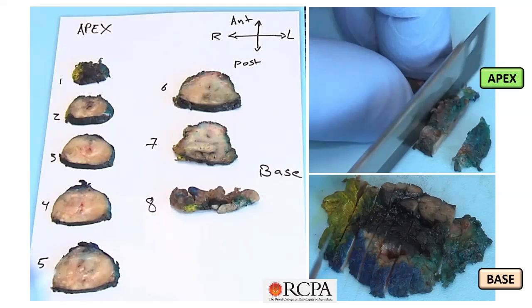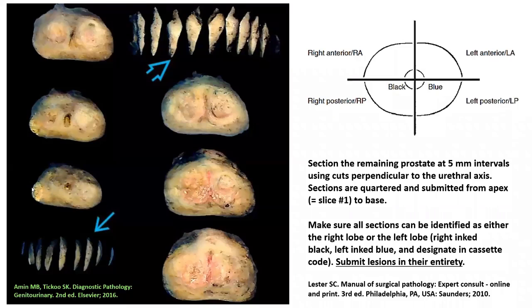Now, ideally, you should section out all these levels as quadrants, or if the section is pretty large, you might even have to give 6 sections. You might have to sextant it out. However, that will lead to probably around 45 or 50 or more blocks for the entire specimen, and the cost factor might not justify such grossing. In that case, you will have to search out areas which are suspicious looking, like over here you see the suspicious areas being highlighted by this cursor moving around.